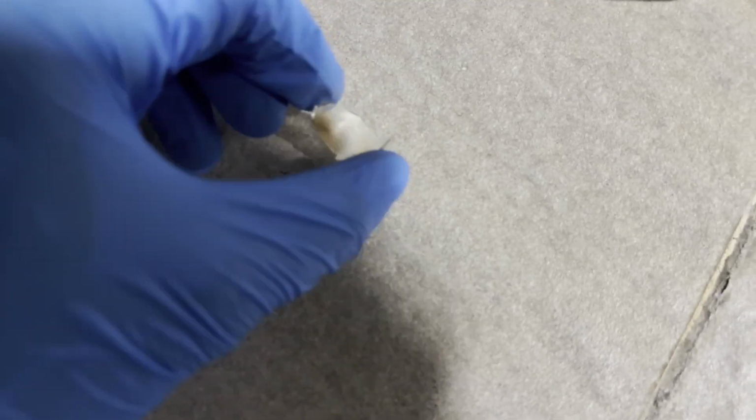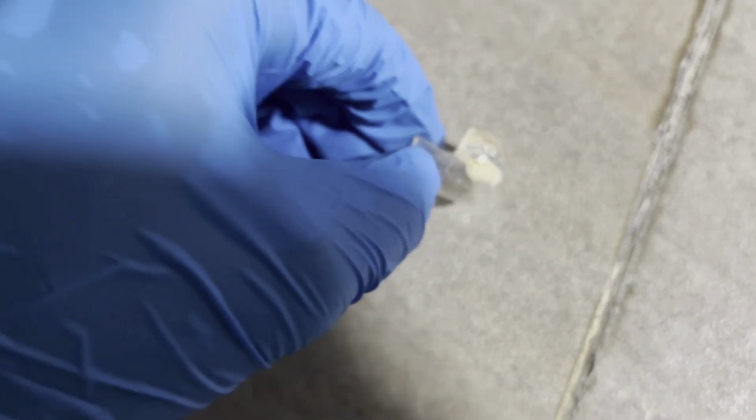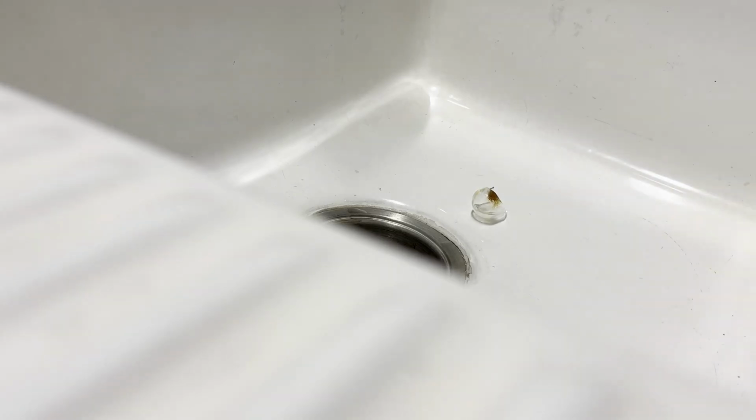However, as I tried to ampule the potassium under the protection of the produced nitrogen gas, the tube shattered, and the potassium immediately oxidized to this white potassium oxide on the walls. Still, you can see a shiny little bit of metal. Carefully adding water to the piece resulted in a few sparks, confirming that potassium metal was indeed produced.